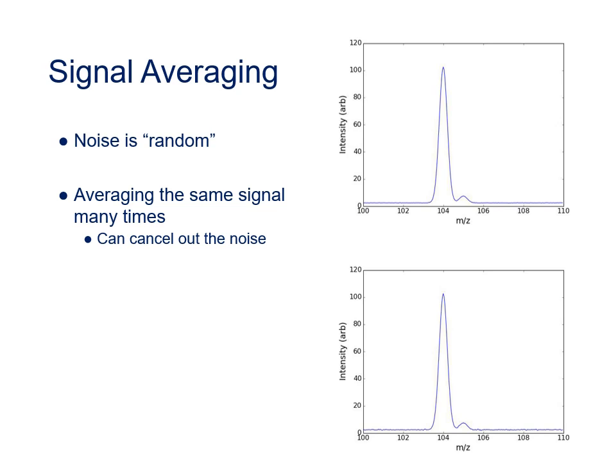The reason why this approach improves the signal-to-noise ratio is that the noise is random. So for any given point, in some spectra the noise will be positive, and in the others it will be negative. So over time it tends to cancel out. On the other hand, the signal is always there, so it isn't affected.